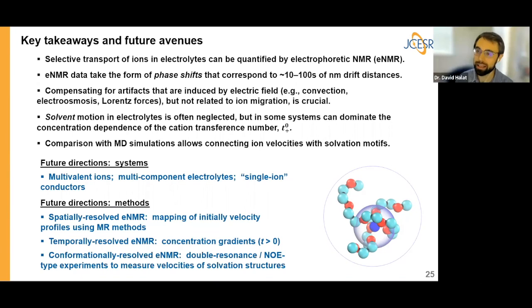Well, I can say I don't have that much experience with micelles, but one of the interesting things about very dilute systems typically is that they have greater mobilities than you would expect. So the conductivity may be low, but if you take the conductivity and divide it by the concentration, that gives you the mobility or the velocity. And so that can be surprisingly high, despite the fact that the conductivity appears low.